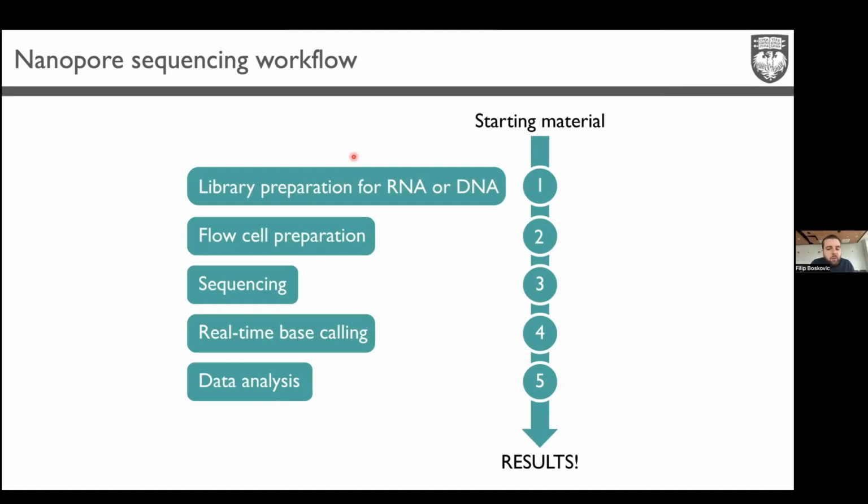You can even, in 2 hours, if you do plasmid sequencing, some people do those. It's very convenient. You have a plasmid sequencing kit, you can pool 96 samples, and you can just run them together. And once you get the sequence that you're looking for, you can just stop the measurement. You don't need to get so much data that you don't need. So in that sense, it's very nice and efficient.